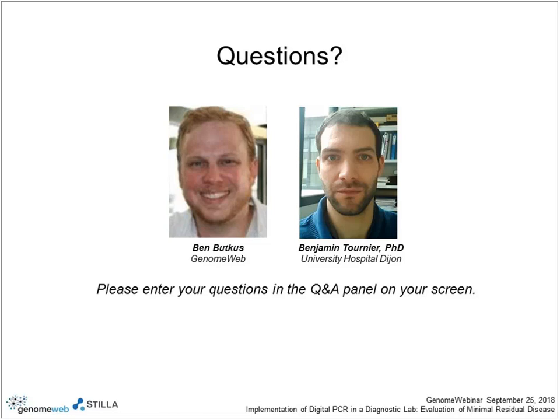Thank you. The next question. What is the minimal DNA fragment size that can be used for the reaction? Do you need to check the size beforehand using a bioanalyzer, for instance? Yeah. Again, it's dependent of your design and of the size of your amplicon.